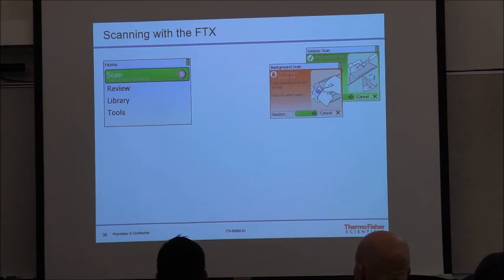Now with that, also remind me that when I crush something on there that's a sample, I have to clean the bottom of that anvil as well. So not only do I clean the diamond, I'll have to clean the bottom of the anvil.